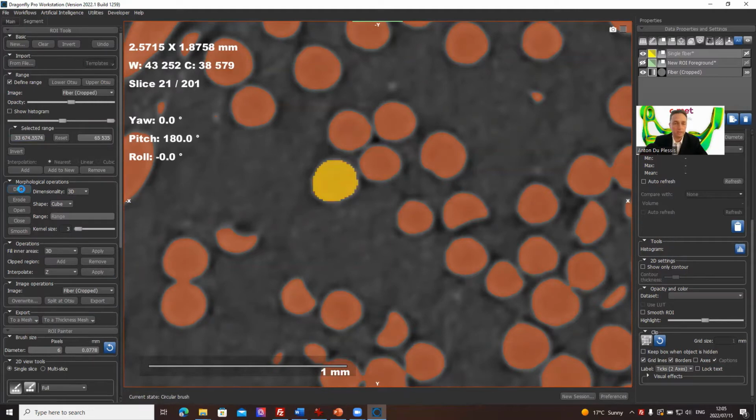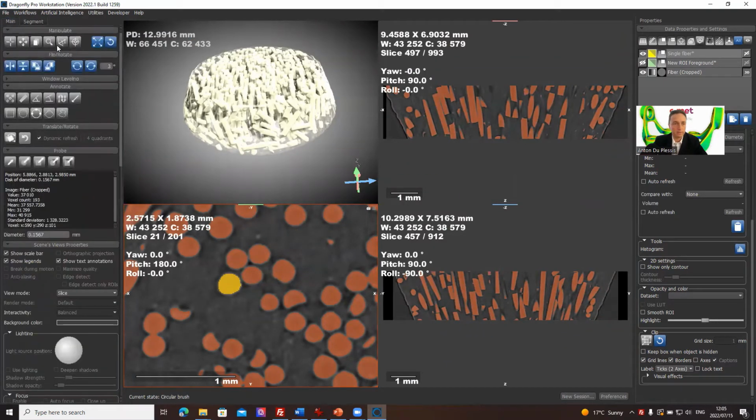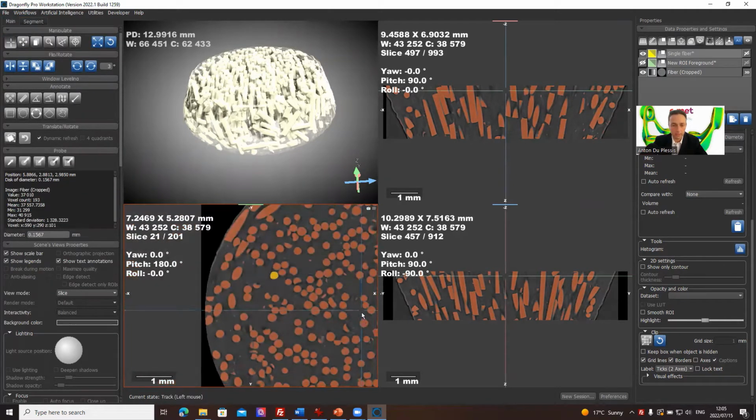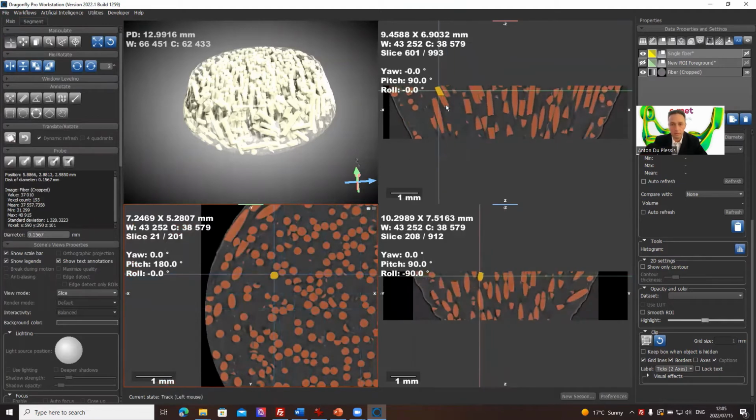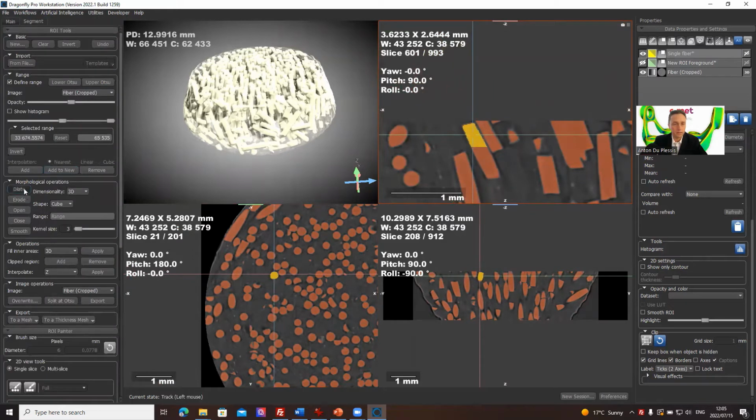range selection. So in this way, let me show you in 3D. Let me just find the exact location of that fiber. So in 3D, now we are dilating. You can see this fiber being filled up as we continue, because it's staying within the range and it's not actually touching anything else at the moment.